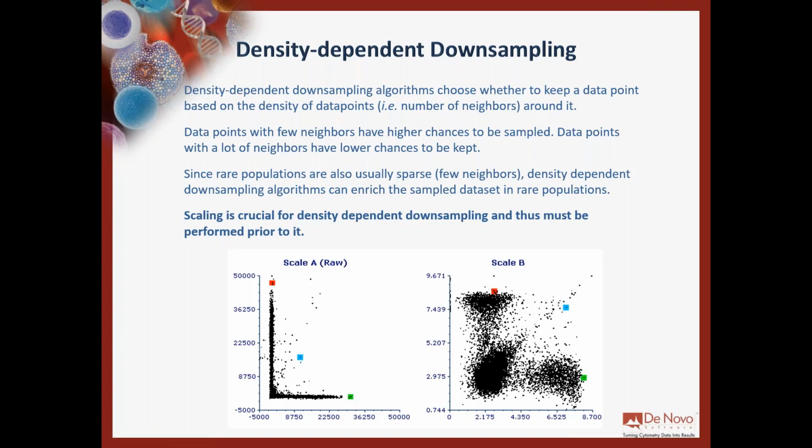This is the same picture we used yesterday, right? This is the unscaled data, and you will see why I'm using that picture again. So we calculate the density of data points around this one, which is the red one. How many data points do we see? Like 5. How many data points do we see here? Like 1. How many data points do we see here?